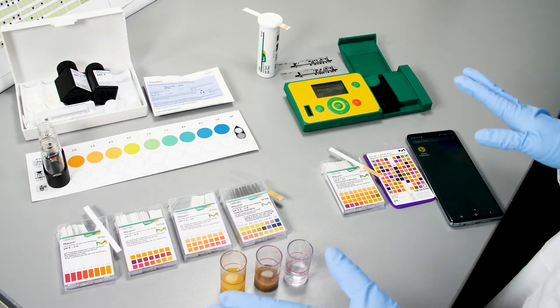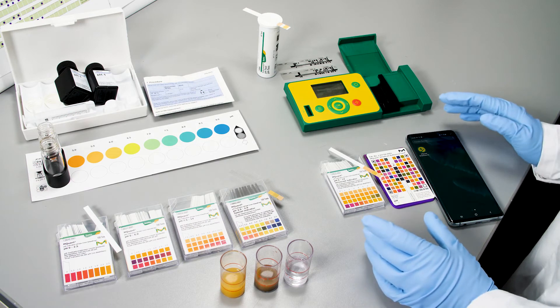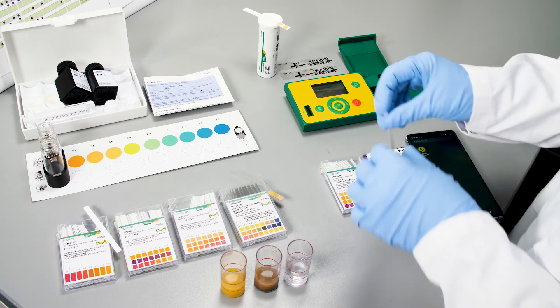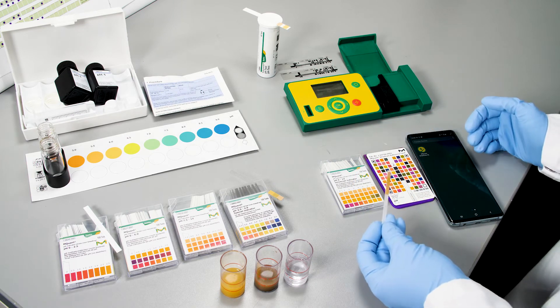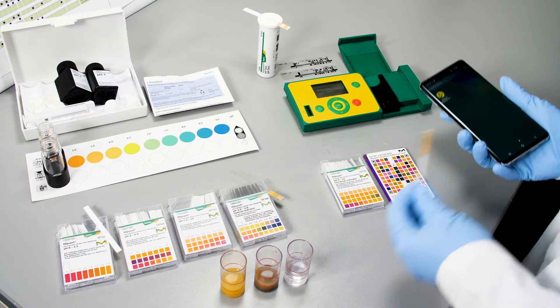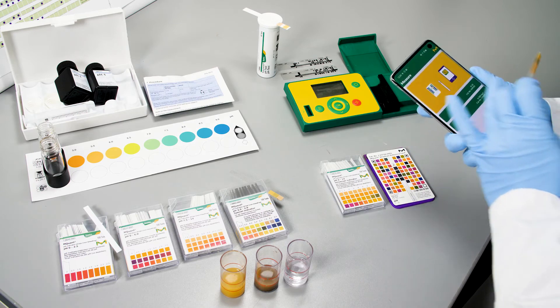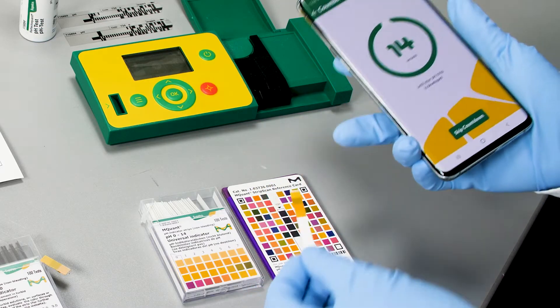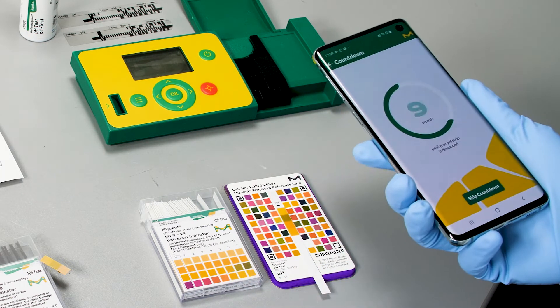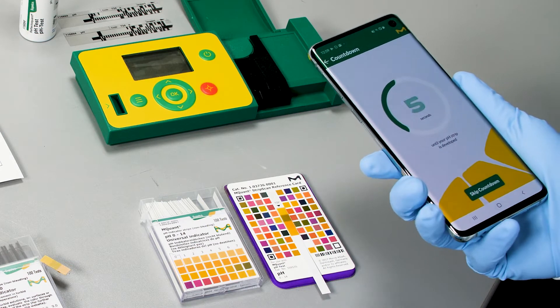An exciting new addition to test-strip readout is our option to use Amquant Strip Scan, an app available on iOS and Android, to read out your test-strip with your smartphone. This adds the additional comfort of not having to guess colors anymore, and you have instant documentation and traceability. You dip your test-strip and select your parameter. While the parameter is counting down, you place your test-strip on the reference card and perform the readout via the smartphone camera.